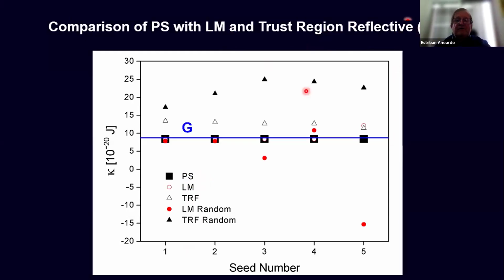The problem is that it's not derivative free. None of them are derivative free. And this is an important point. PS is derivative free. So when your function has a complex derivative, this will be a big problem when you fit. That's why derivative free methods are very interesting, especially when you have a multidimensional space of high order, like this.